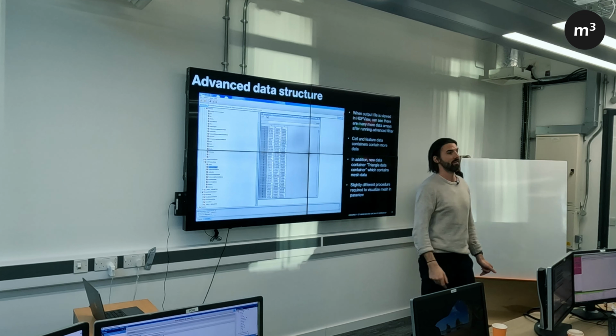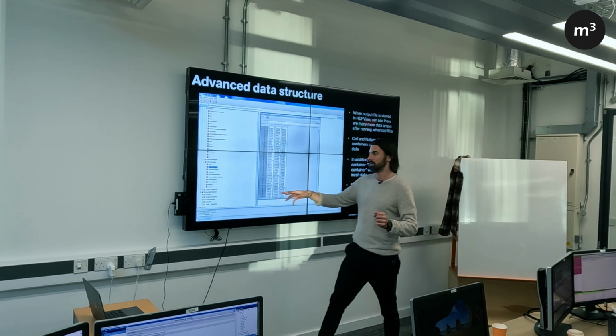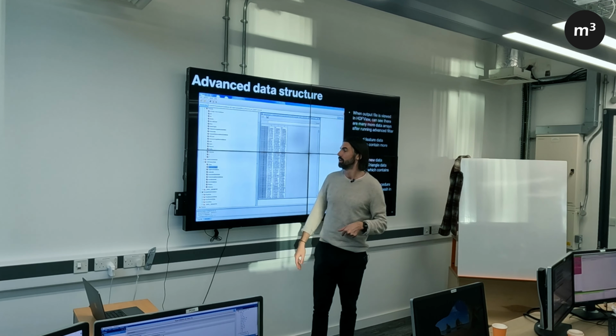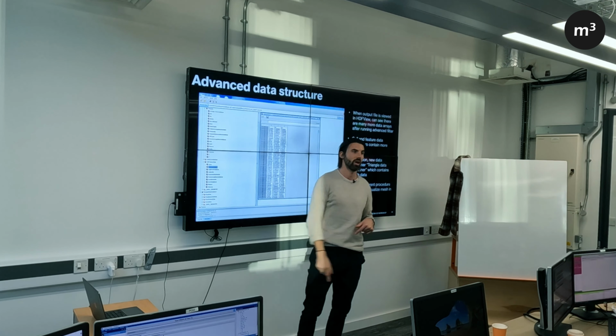So now if we ever wanted to go in and properly calculate our grain boundary planes and everything, that's how we do it with this triangle data container. So once we create our mesh, we get a whole new data container. So you end up with 3 data containers, basically your cell data, your feature data, and your triangle data.